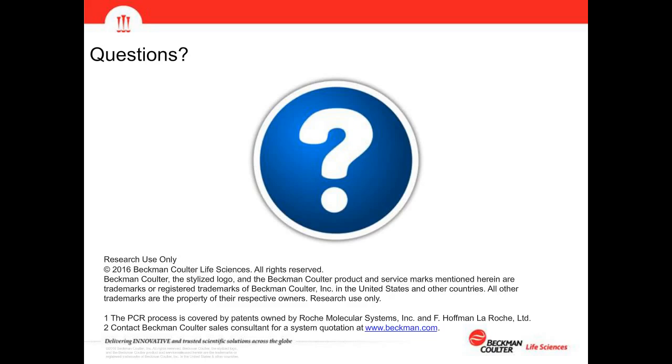Dr. Overkamp, more than the confluency, is it possible to count cells in a well? Yes, it is possible to count cells in a well. Again, it's not so much a feature of the automation. It is more a feature of the integrated device itself. So if the device offers that option, we can definitely do that in an automated fashion as well.